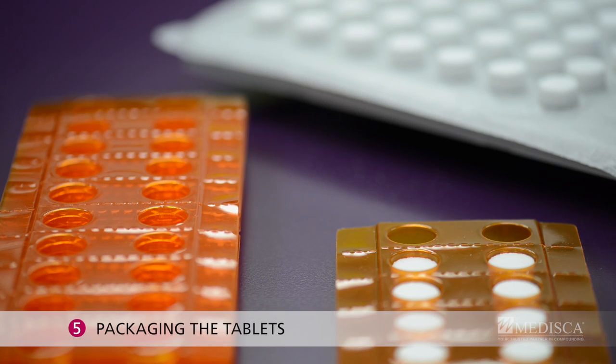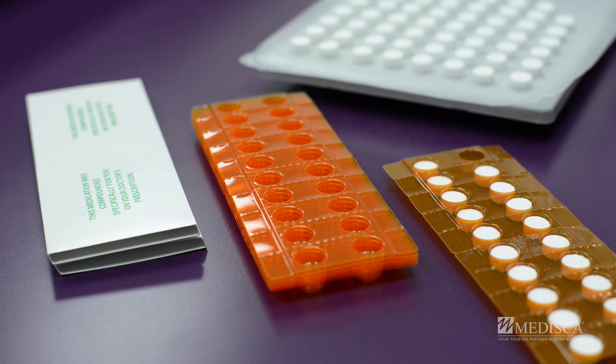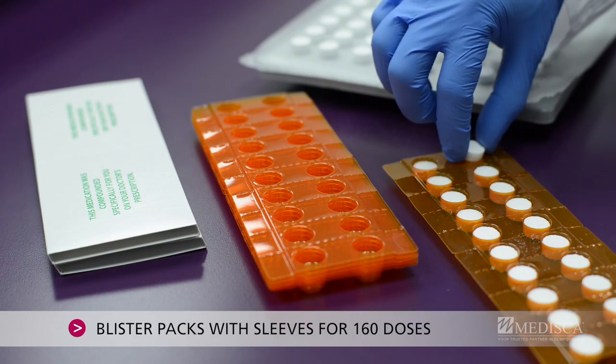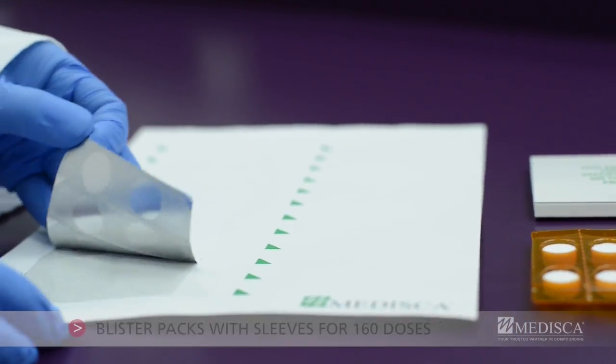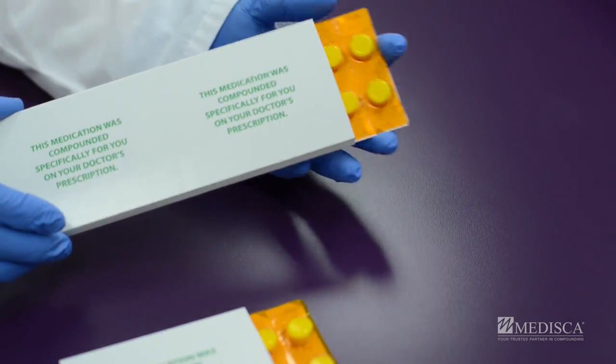Step 5: Packaging the tablets. Now you're ready to dispense your compounded RDTs. Transfer the tablets into the amber circular blister sheets, attach the adhesive foil tamper labels, and slip them into the sleeve.